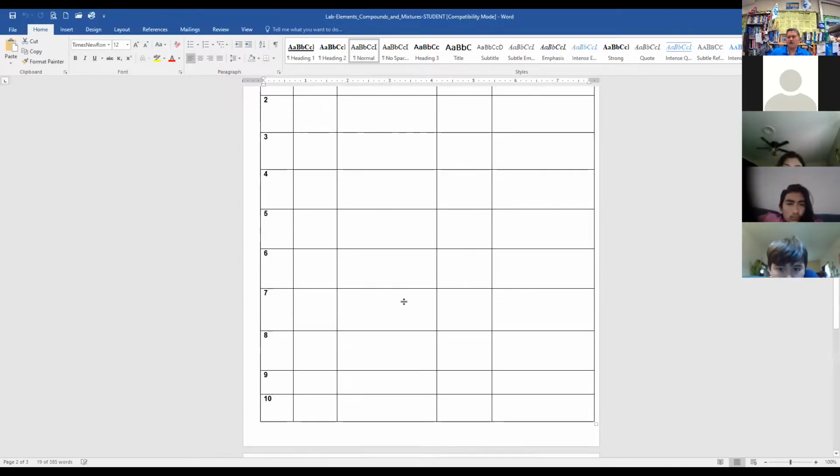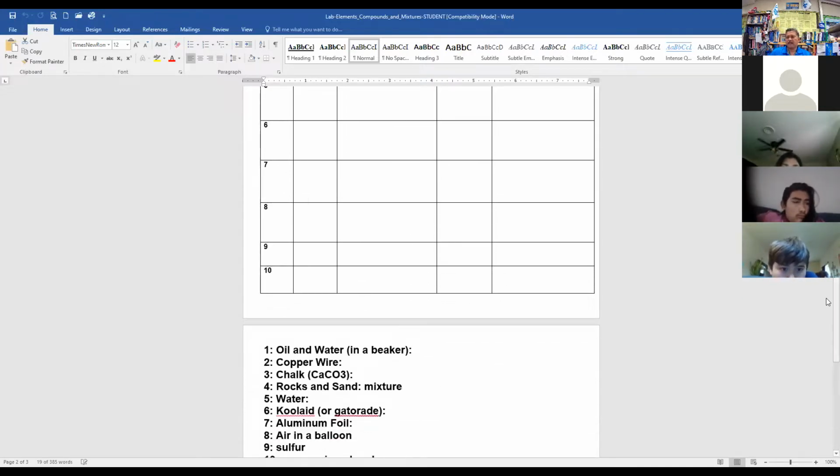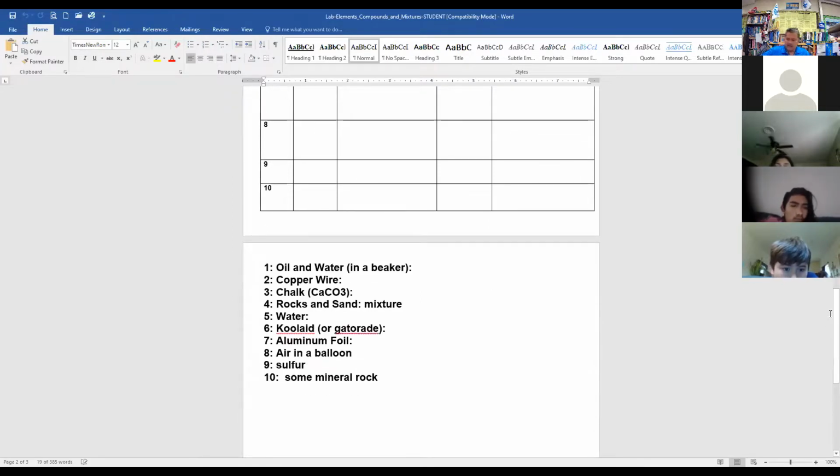All right, so I have a list of items right here, and since I'm going to be away from this list, I won't be able to see it. I'm going to write the numbers down because, like I said, I won't be able to see it. So number 1 is oil and water. Number 2 is copper. Number 3 is some chalk.